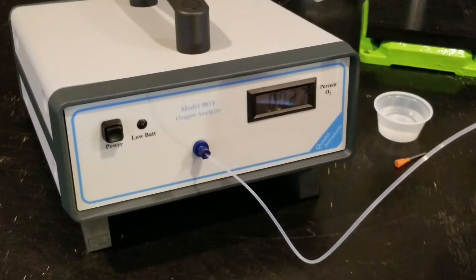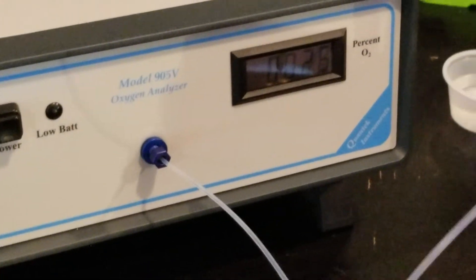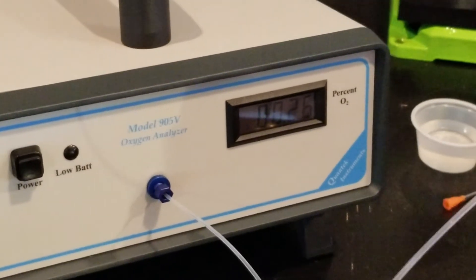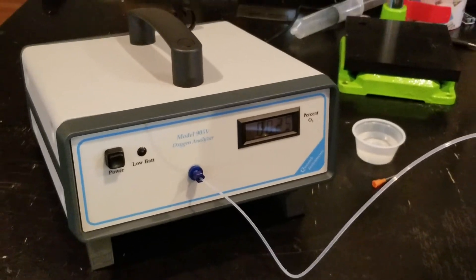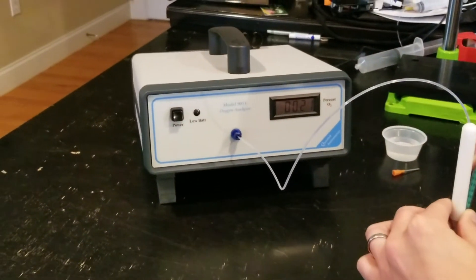You'll know you're done when the reading stops moving because it will start to kind of bottom out. You want to be very careful that you don't get any of the water sucked back up into the sample probe, because then you risk contaminating the sensor.